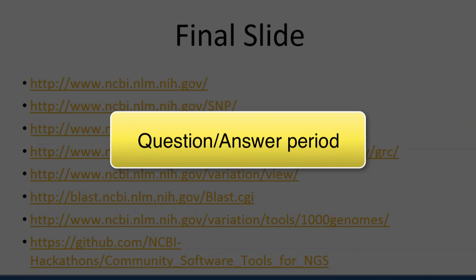So if you have other tools, please let us know, and we'd be happy to incorporate them into a future webinar of this kind. These webinars have been relatively popular, and in my opinion, NCBI should be very committed to making databases that work with external tools.